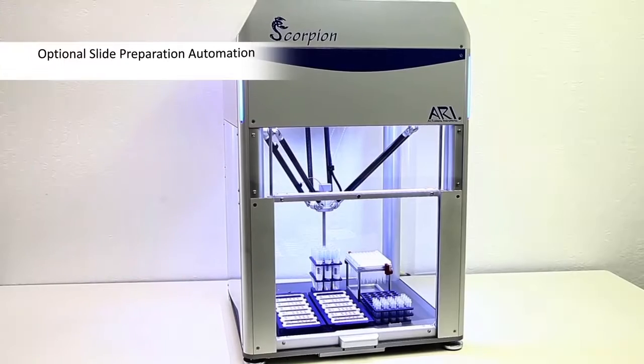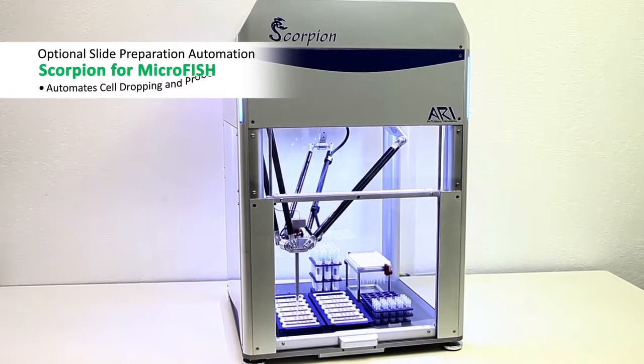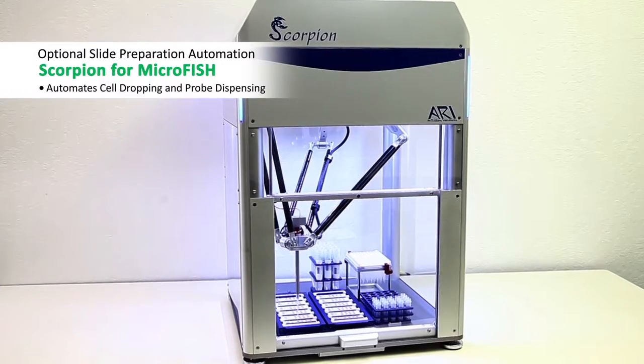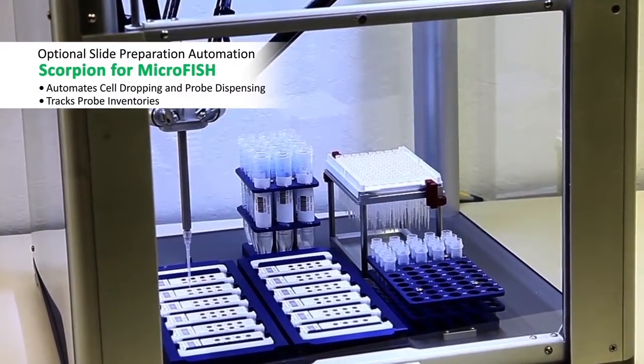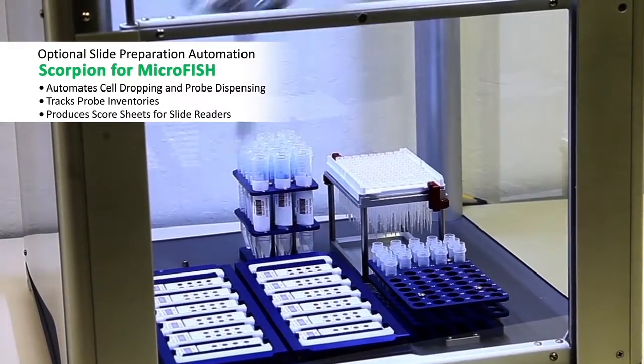With the optional Scorpion for Microfish, you can also automate the repetitive pipetting steps for cell dropping and probe dispensing. In addition, the Scorpion tracks probe inventories and produces score sheets for the slide reader.